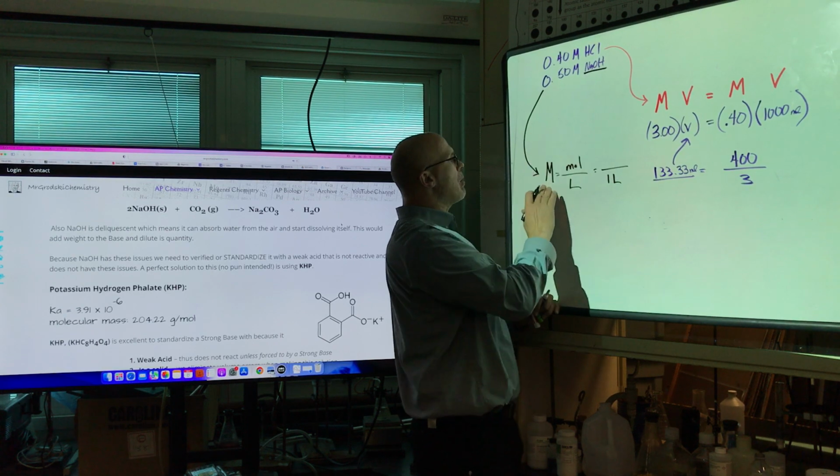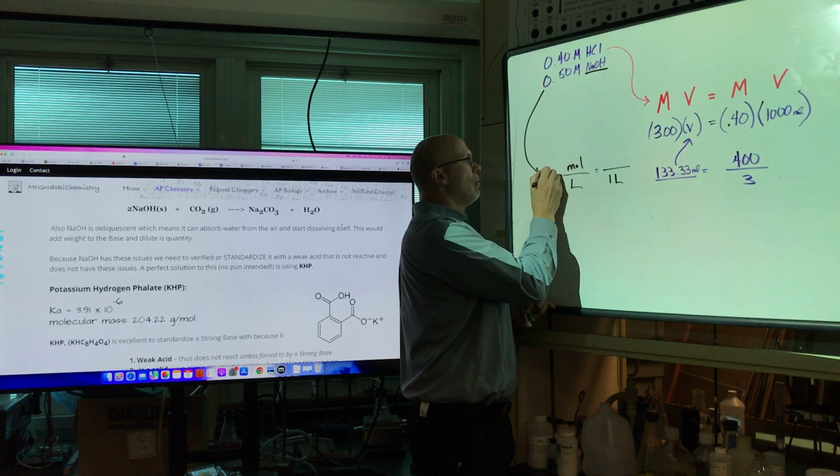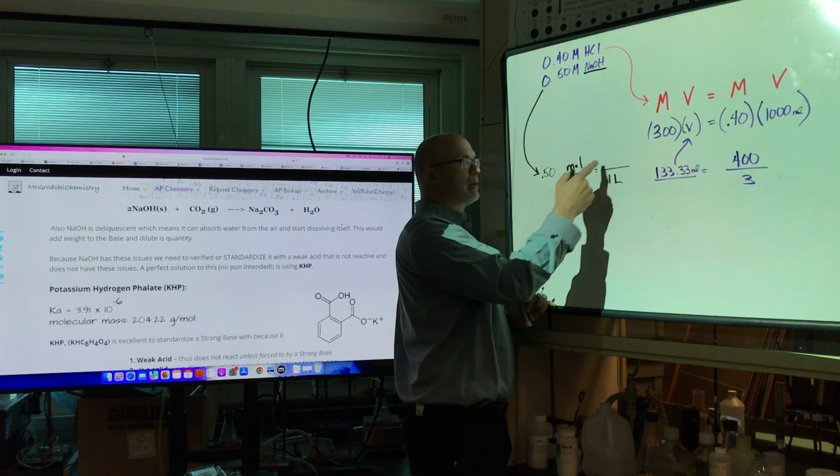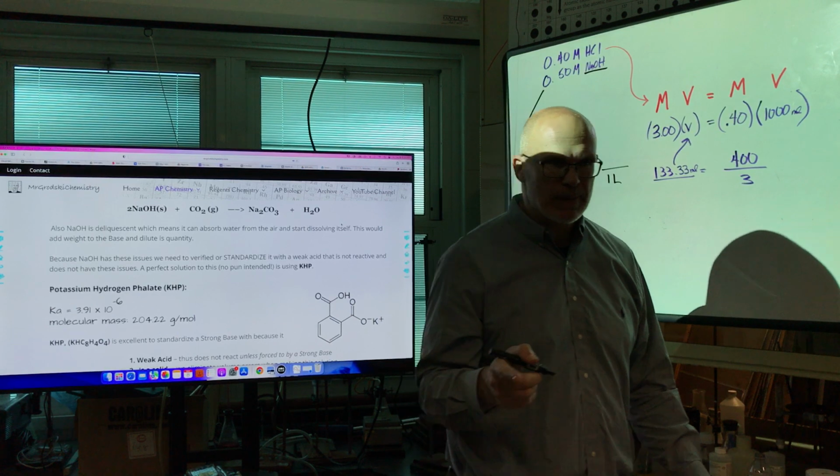Now, what's the molarity we want? Well, we want 0.50 molar. So can anyone solve for how many moles I need? It's over 1. Okay? 0.5.